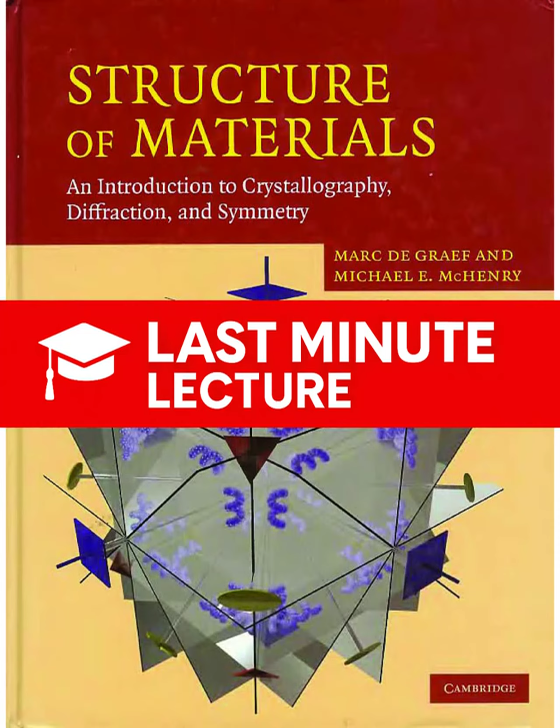Correct. The powder diffractometer is the workhorse. Monochromatic radiation, variable angle. The Laue method is the opposite. Polychromatic radiation, stationary crystal. And then you have more specialized techniques like Weissenberg and precession. We're going to focus on the two main characterization methods, powder and Laue. Great. Let's start with the powder diffractometer. You see these everywhere in material science labs. Its fundamental characteristic is the sample itself.